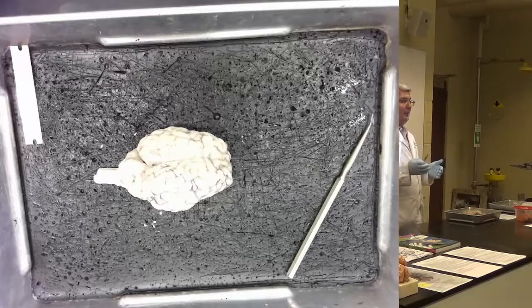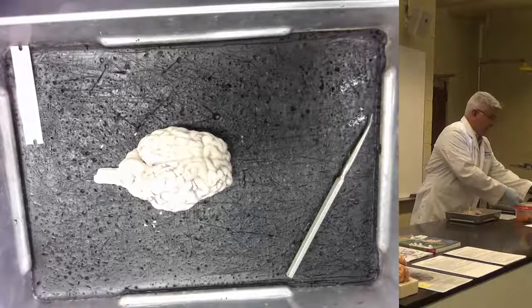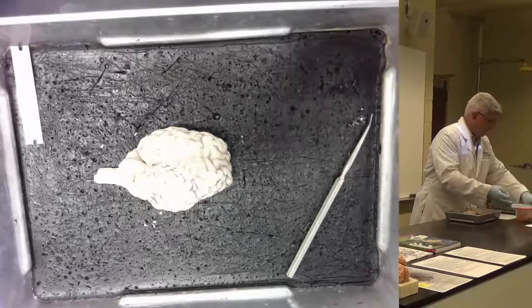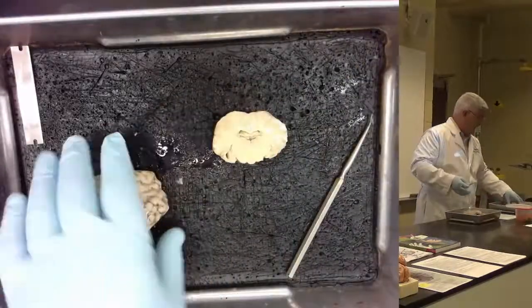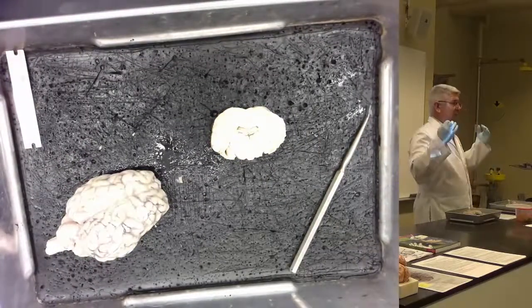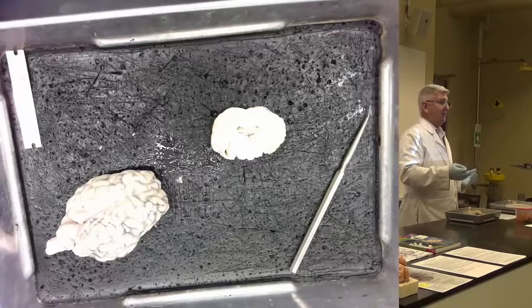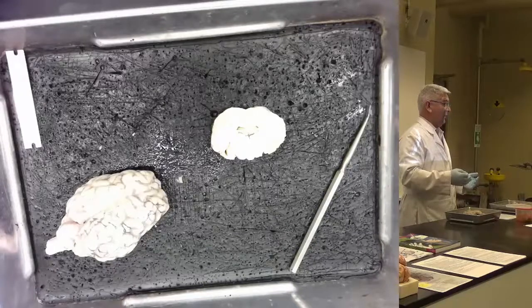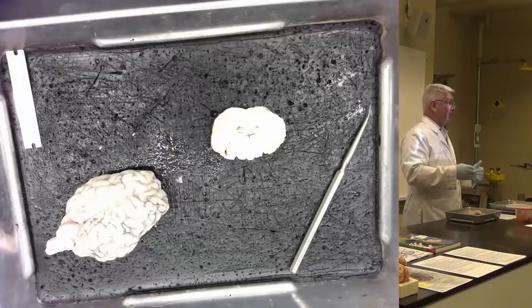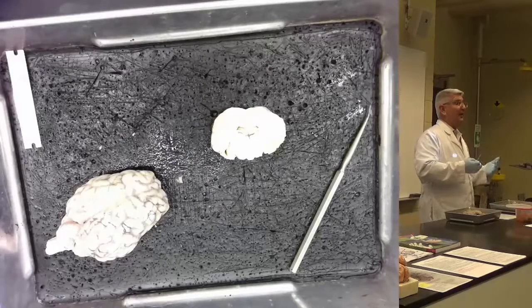But when you go in for the practical, you're just going to have a slice, right, that looks like that, right? And you're not going to be able to see from other pieces if it's the front or the back. So I'm going to teach you how to orientate and how to know if we're in the anterior, posterior part of the brain and what the landmarks are. Okay? Good. So it's important. You can rehearse with the whole brain, but it's important at some point today to practice just random brain slices.